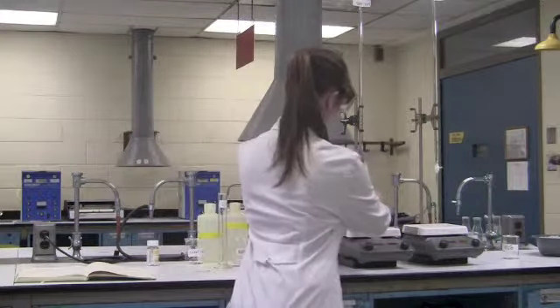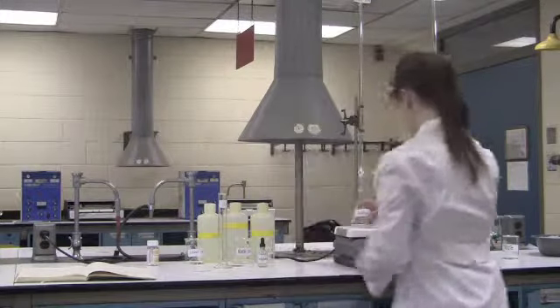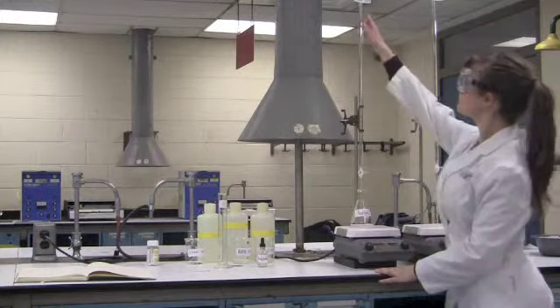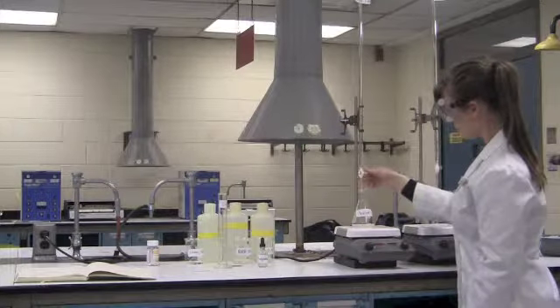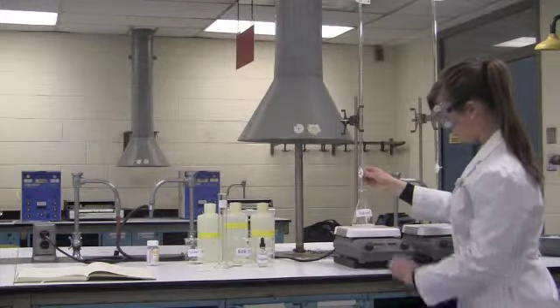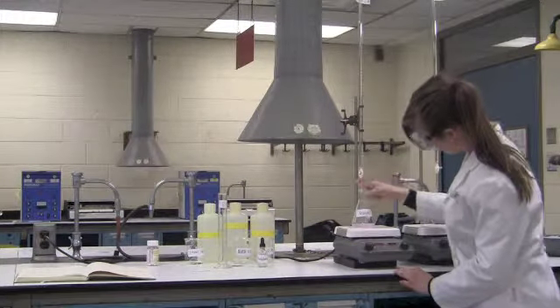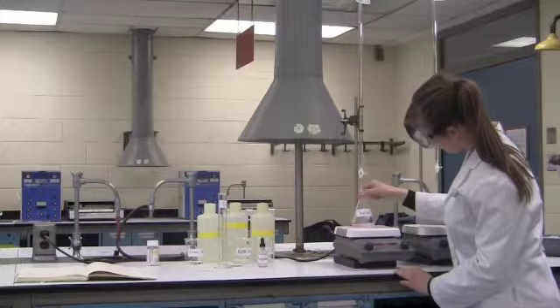Now she will begin the titration. Her initial volume is 0.00 milliliters of NaOH. She will continue to add the sodium hydroxide until the solution turns pink. We now see the solution has turned a light pink.